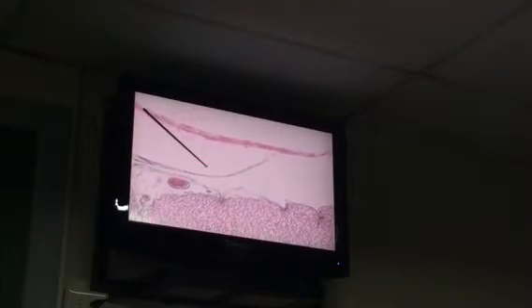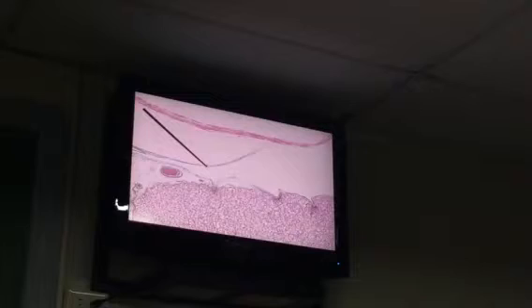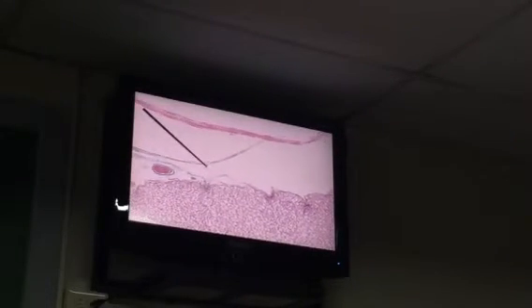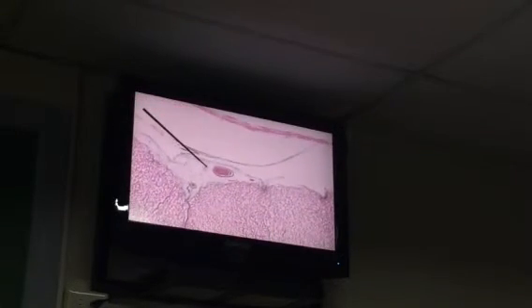That is the outermost. This is part of your second layer, the arachnoid. It's also described as thin, fragile membrane. Usually we see fibers projecting from it. That's why we call it arachnoid for the word arachnida. And this is the third layer here. There you go, you can see. Again, it's described as vascular and closely adherent to the surface of your spinal cord. We call this, of course, pia mater.